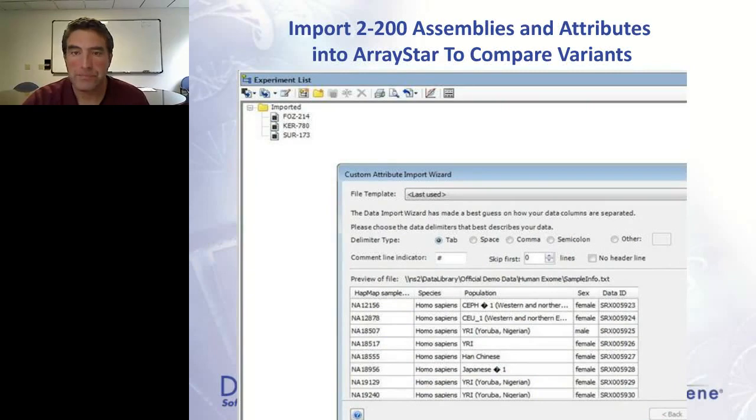But you can see with SeqMan, it allows us to look at all the assemblies. But when you start doing larger projects, or if I've got several thousand SNPs in each one of my samples, it's very difficult to manually go through and look at a thousand different locations. Most people don't have the time or patience to do something at that scale.